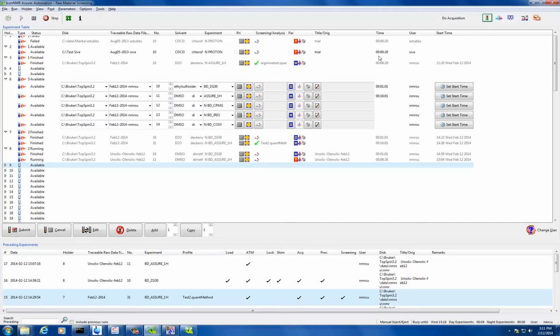Then I'll just put all these on the list. The only thing is, every time you make a change in the configuration, you need to restart the icon. So this is running. I'll wait until it finishes running. I'm just going to try to get as close to 500 as possible. Sounds good to me.